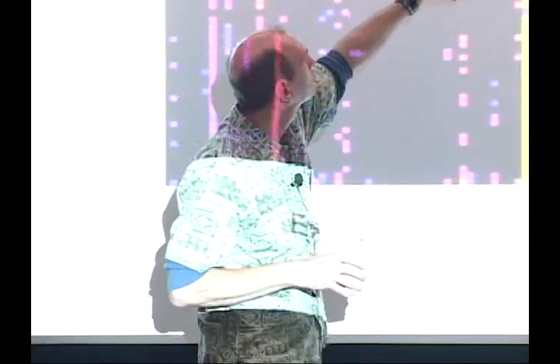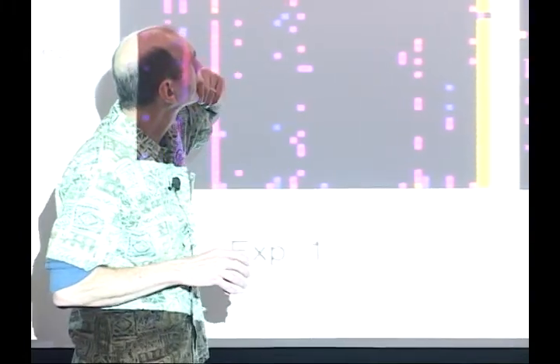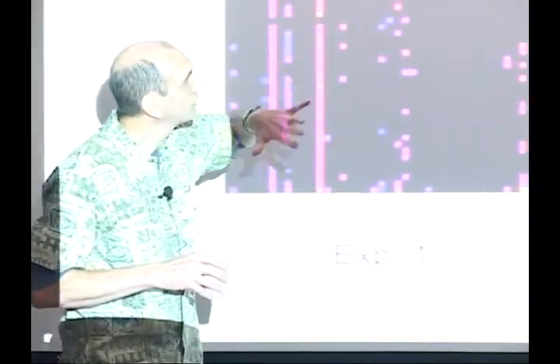Do you usually do a bunch of different housekeeping genes and then pick the average? In this case, we've been usually doing two. We've been doing GAPDH and 18S, I think. And I think the GAPDH is usually a little lower than the 18S. And so I think we like the GAPDH, but, well.